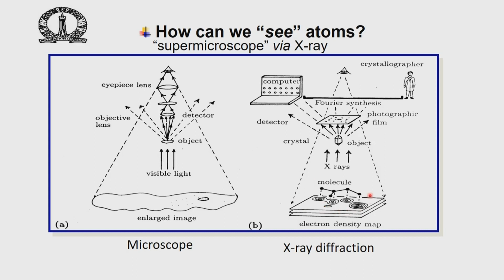So, we do get an electron density map, as we call it, and this electron density map not only identifies the positions of the atoms, in terms of its strength, it also identifies the nature of the atom, whether it is a carbon or a bromine or a nitrogen or whatever. So, that identity of the molecule can be obtained from what we call the electron density map.